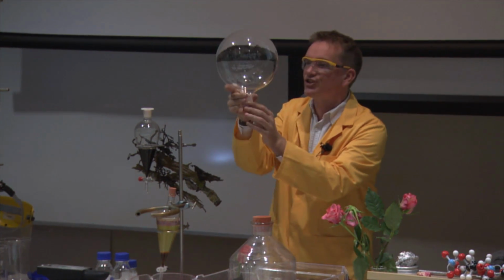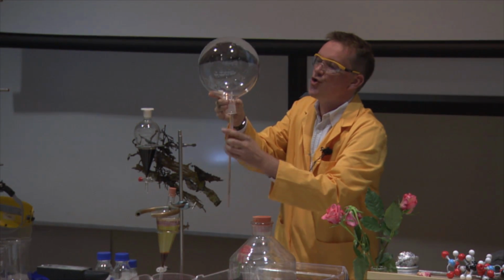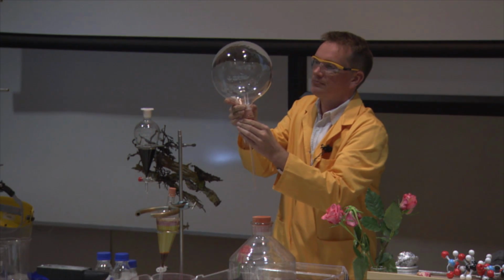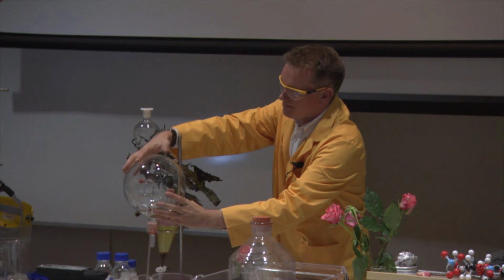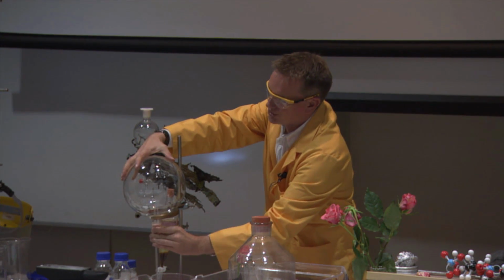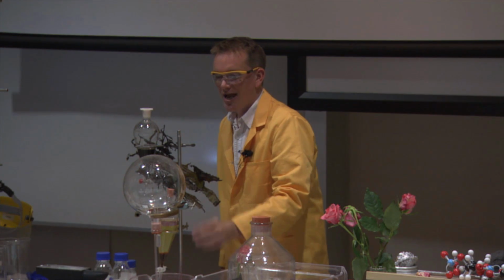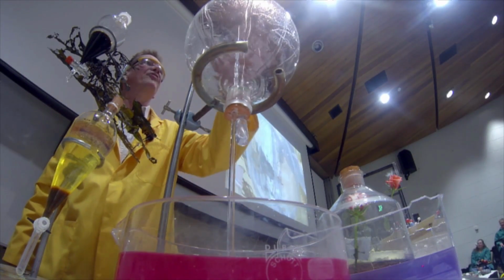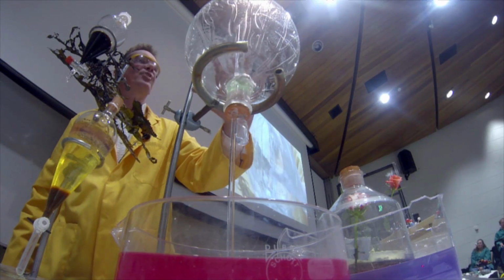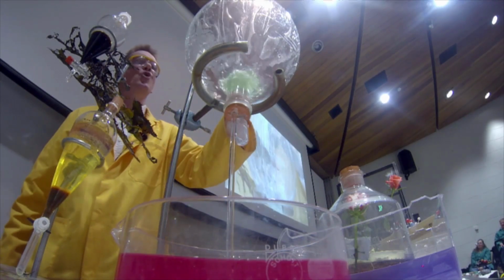And I'm going to swap the stopper here for another stopper. Here it is. And this stopper has a tube running up through it. Okay, I'm just going to put this back into the clamp here. So the tube is now going into the water at the bottom. Now I'm going to squirt a little bit of extra water in, like that. And the ammonia is very, very soluble in the water, so it's dissolving there. And this is reducing the pressure in here, which means the atmosphere is pushing the water up the tube.